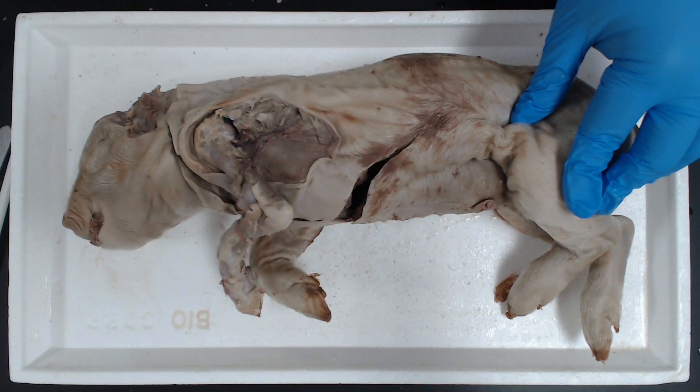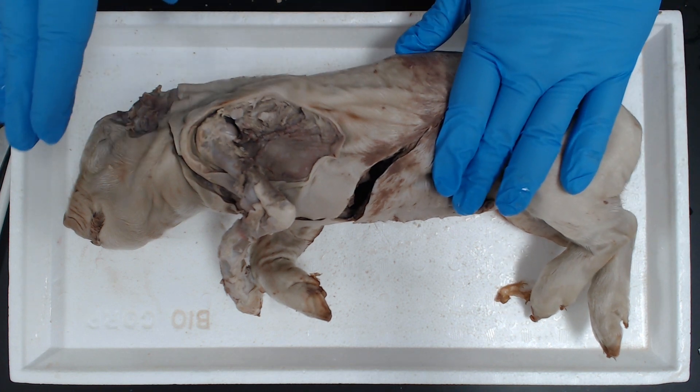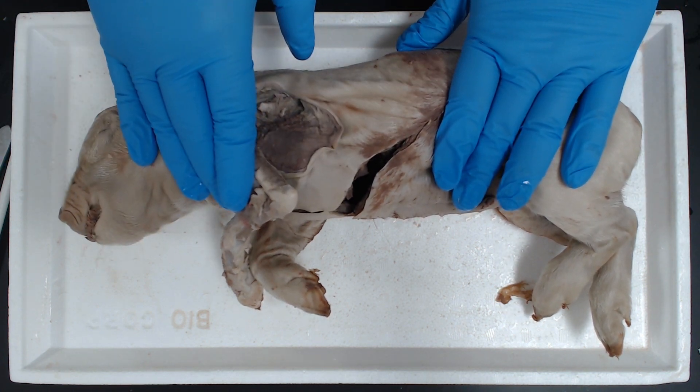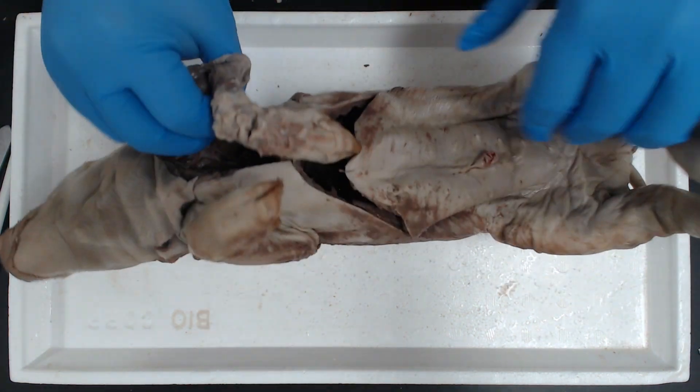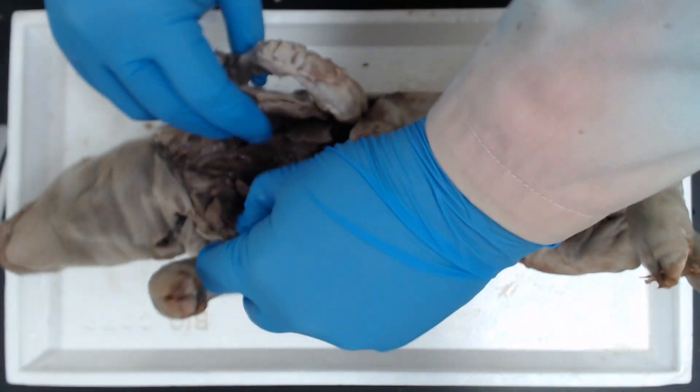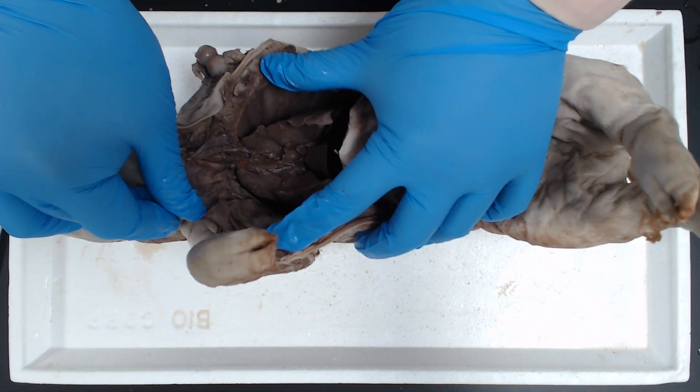To start our dissection, let's get our pig and put it on your surface. We've been through a few dissections with this pig so far, and our thoracic cage is already open. So that's going to make a lot of our job a lot easier.